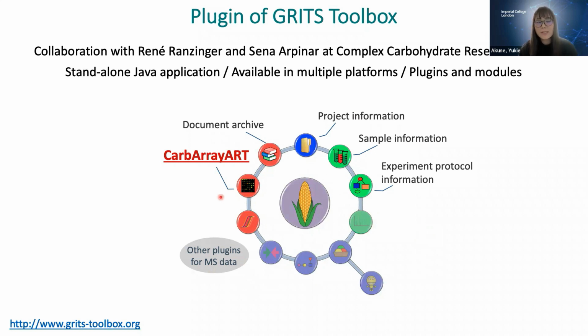So CarbArrayART can also use some of the functions like project management, sample management, experiment management, but we developed a new scheme for Glycan microarray data.